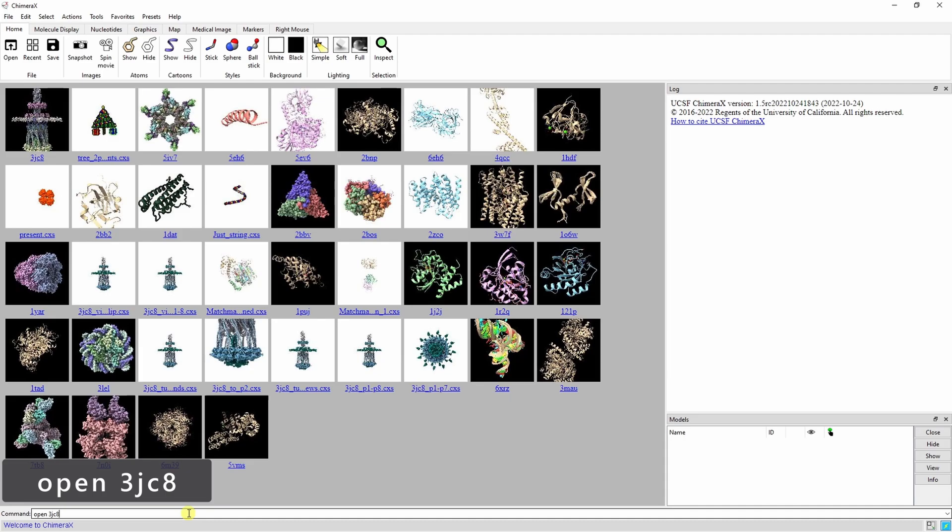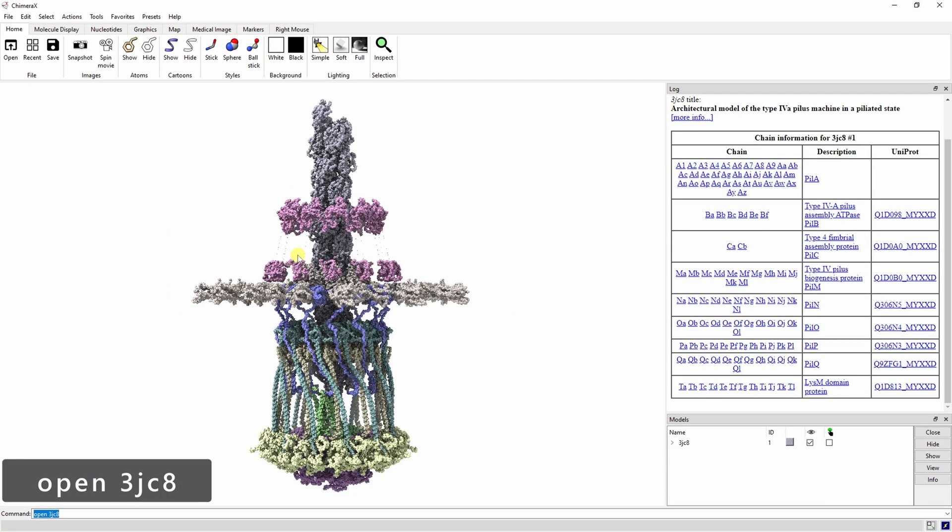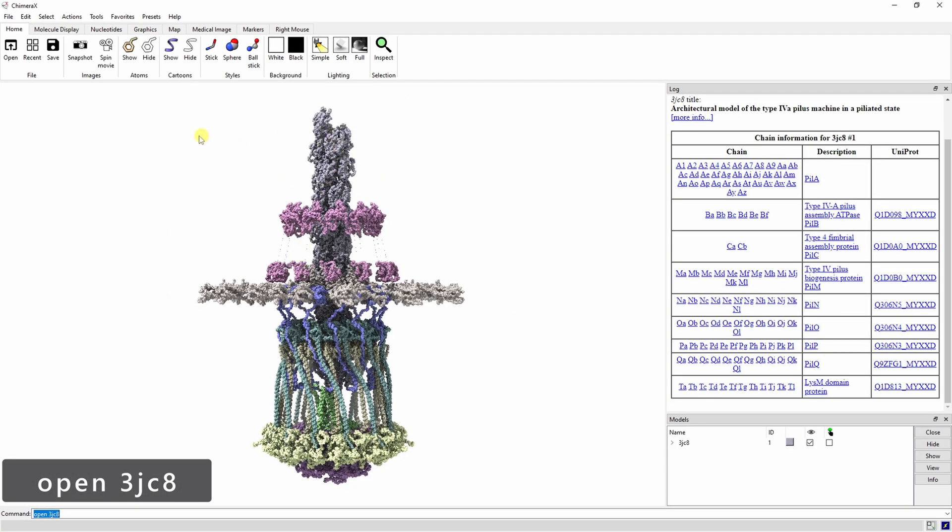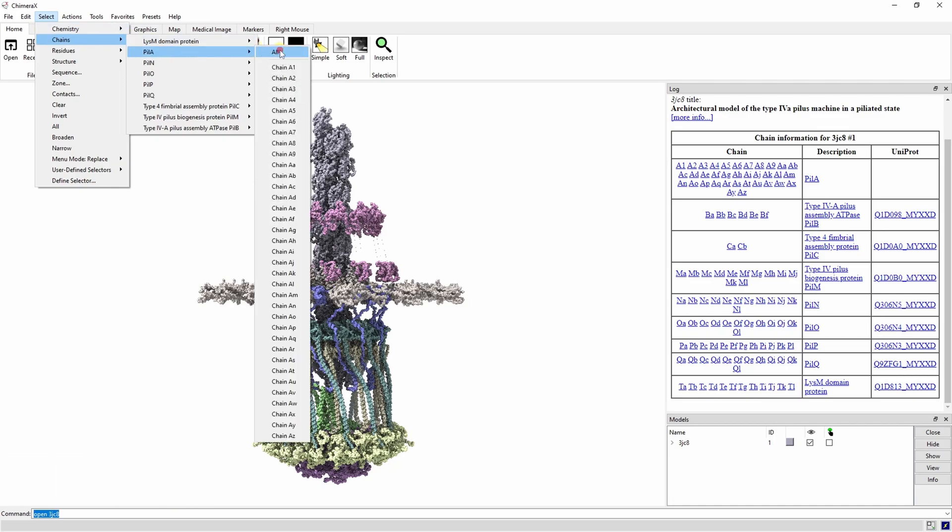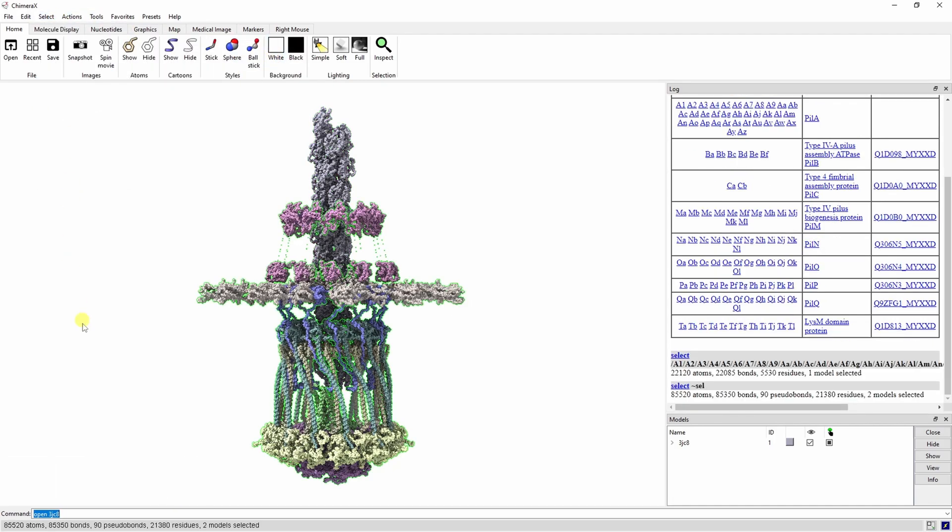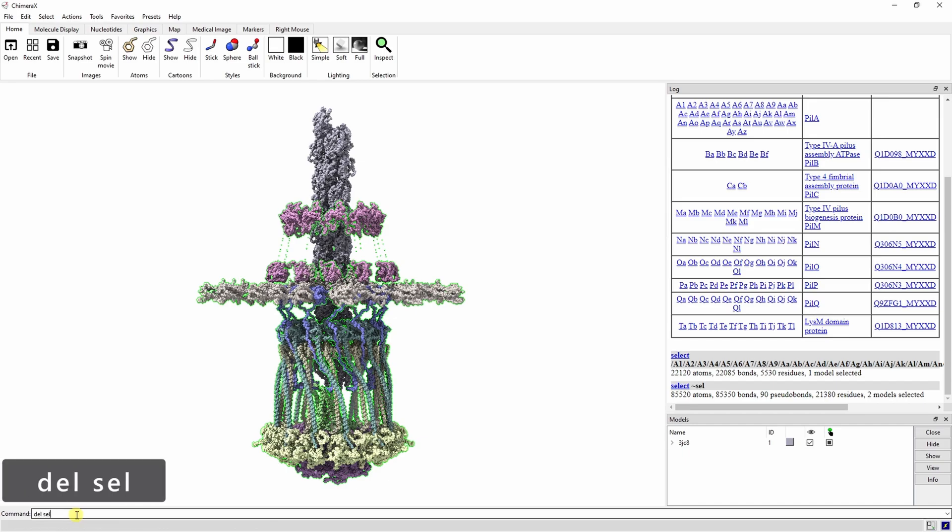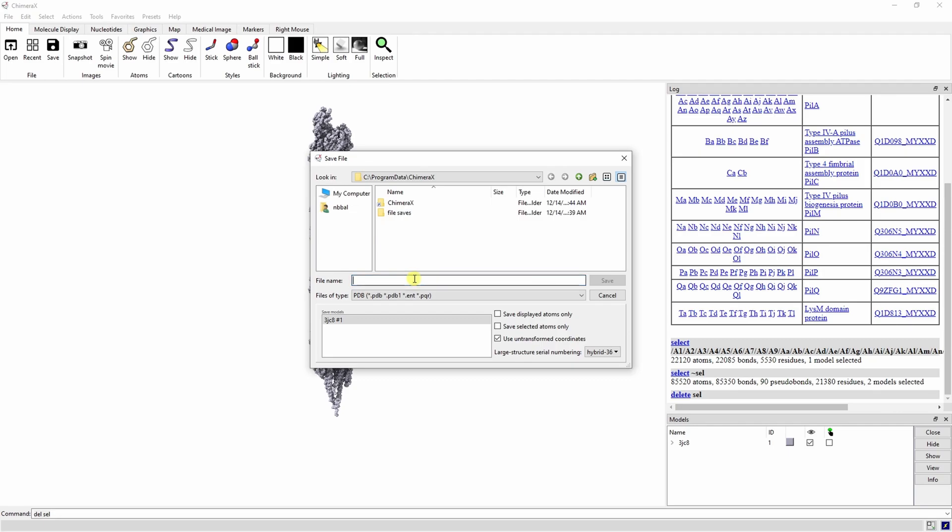Let's start out with 3JC8. This protein is a pilus extension complex that moves bacteria around. We can use the A chain of this protein as the tree trunk. Using the select tab, select all of chain A, then invert the selection. Delete the selection and save it as a PDB.